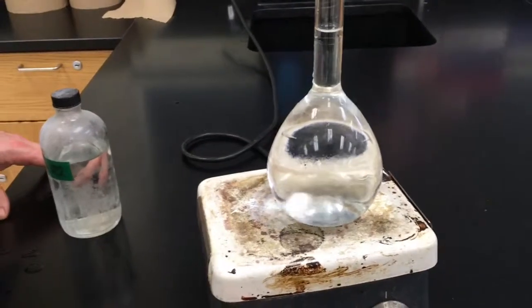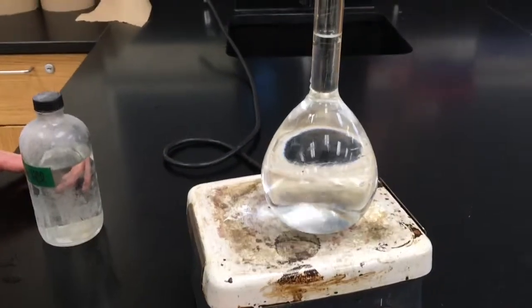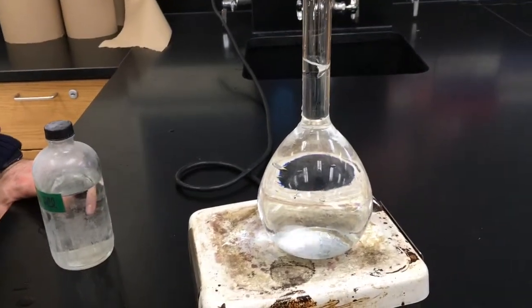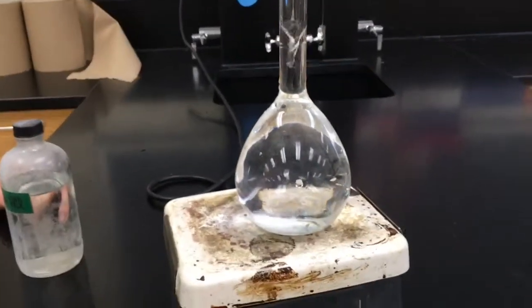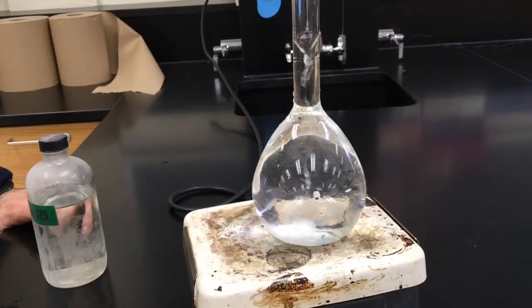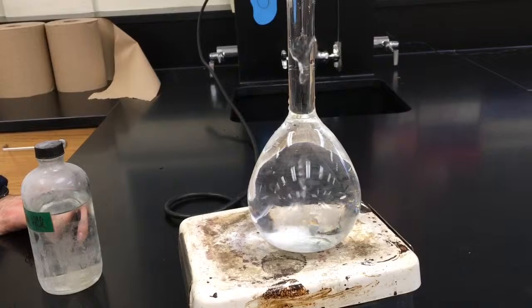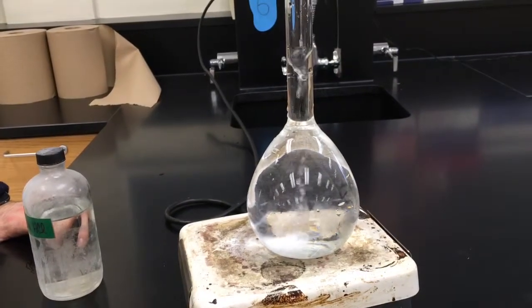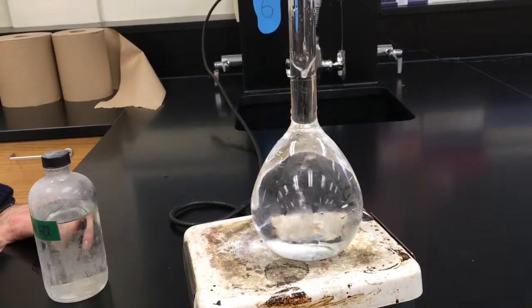I like when you use terms like viscosity. It's like you're bringing the physics into the chemistry. Yeah. Oh, look, now it's all kind of uniform. Whoa. Get the cyclone going. Oh, that's really cool. Yeah, that's pretty wild. So I would say, a minute or two, and it's mixed pretty well.